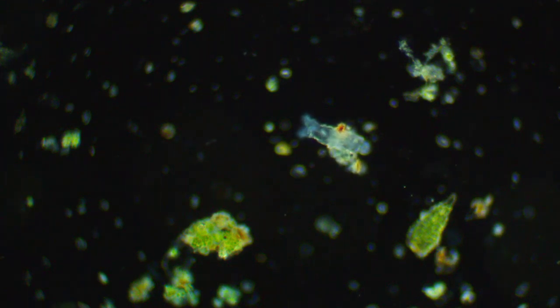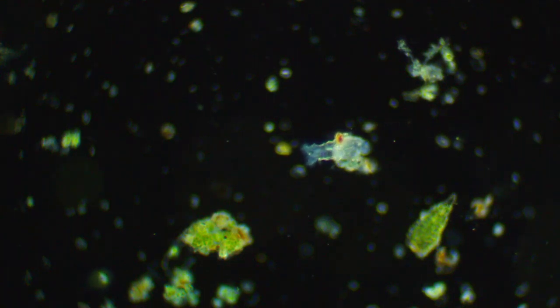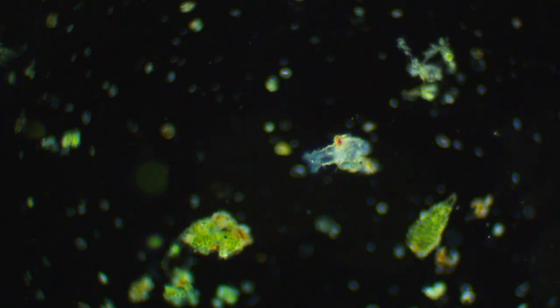So you can see the rotifer, it's got those little mandible-like things on the inside. They're kind of chomping away, like it's chomping at food. I think it's a little pair of mandibles that help digest the food as it's coming in, chew it up.